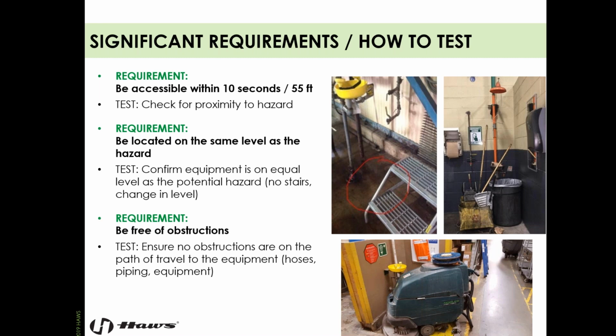You've got a mop bucket, you have additional equipment, lots of stuff gets piled up in front of emergency first aid equipment like this because it's used so rarely. And we hope it's used rarely, right? You have to have this thing. We hope you never, ever have to use it. But if there are obstructions in place, it's going to be more difficult. It's going to cost you time before you can get to that piece of equipment and start using it.